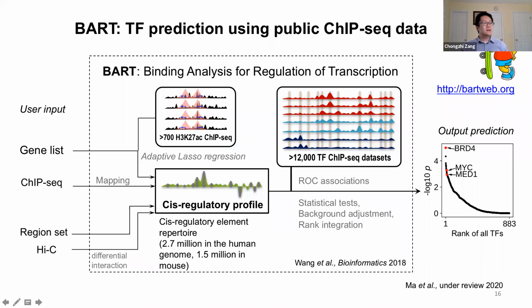This is a tool that my lab developed based on a large amount of collected ChIP-seq data for nearly 1,000 different transcription factors in the human or mouse genome. We built this tool called BART, standing for Binding Analysis for Regulation of Transcription.